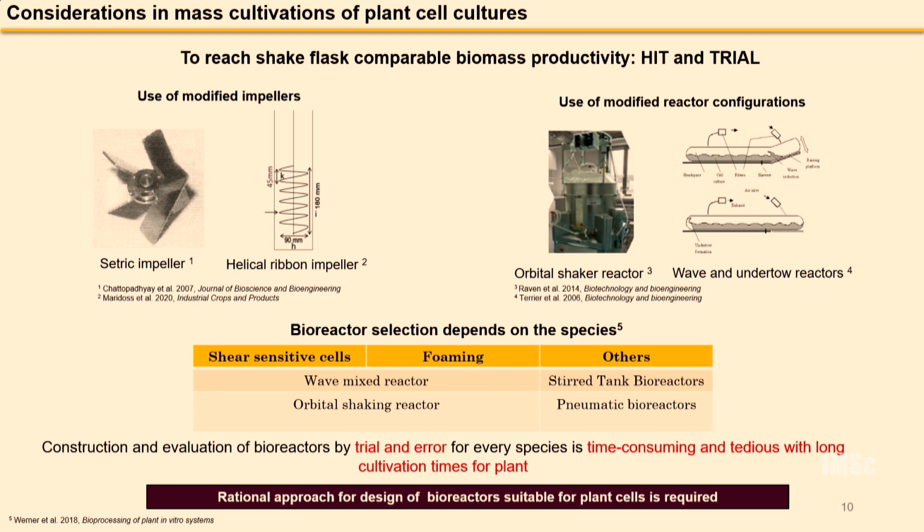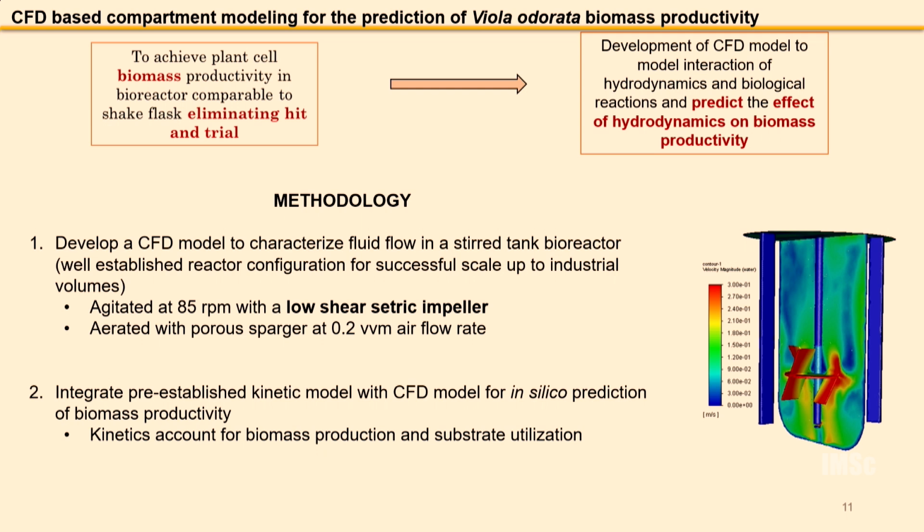It is not a common thing which can be useful for all the cultures, because some cultures have very good suspension ability, and some cultures have lots of large aggregates. So it is again becoming a very species specific thing. If we are going to do it in a hit and trial manner, it is going to take a lot of time. So whether we can look for a rational approach to do this. We have thought of using CFD to see the effect of hydrodynamics on the biological reactions by coupling the hydrodynamics or the CFD data with the kinetic model.